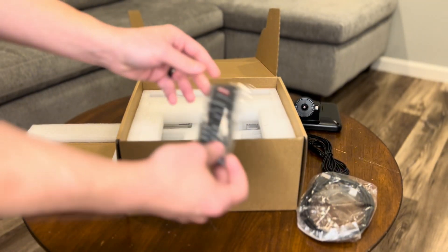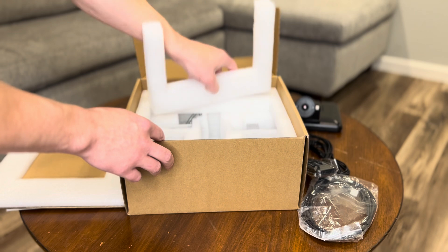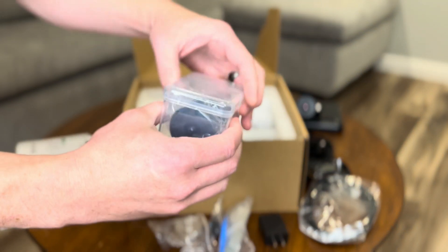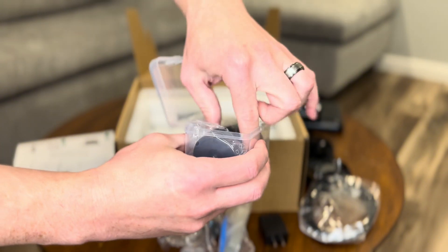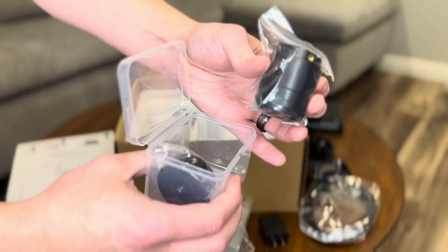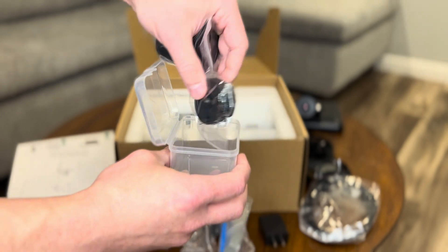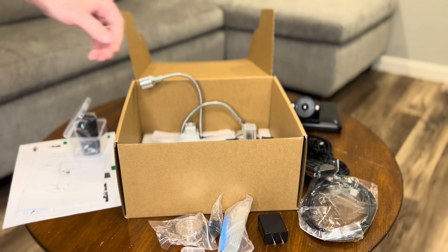This model comes with three different lenses. One is already attached, and the other two come in a little carrying case. The different lenses are used for different types of magnification. It also comes with an adjustable stand, which is essential for getting those perfect viewing angles.